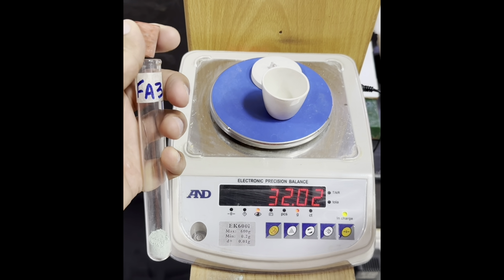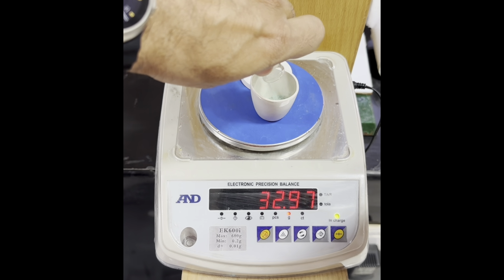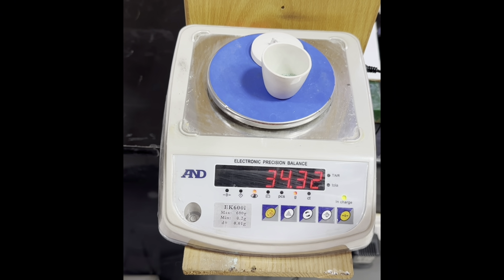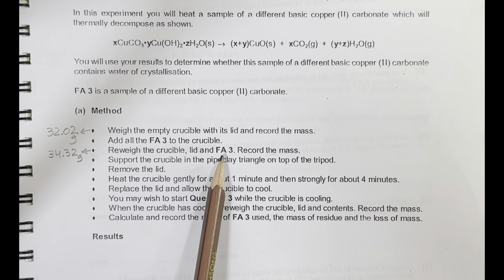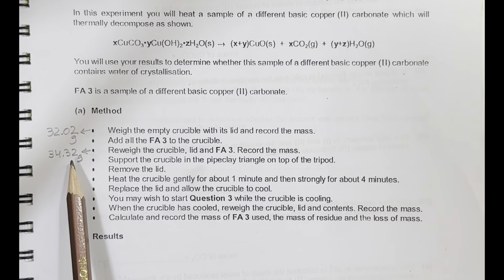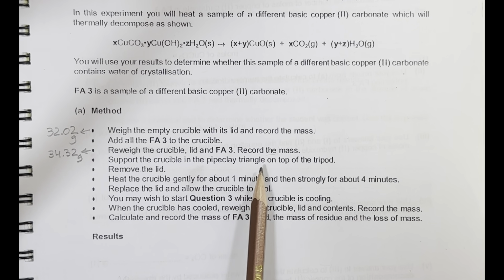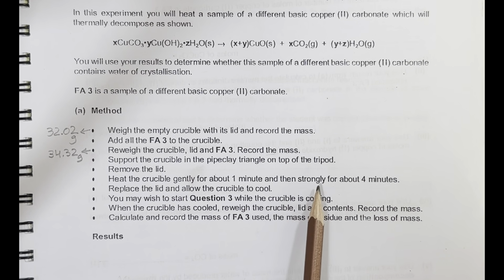Now let's transfer this FA3 into the crucible and record the mass of crucible with lid and FA3, 34.32. Mass of crucible, lid and FA3 is 34.32 grams. Next, support the crucible in a pipe clay triangle on the top of the tripod. Remove the lid and then heat the crucible gently for 1 minute and then strongly for about 4 minutes. So let's do it now.